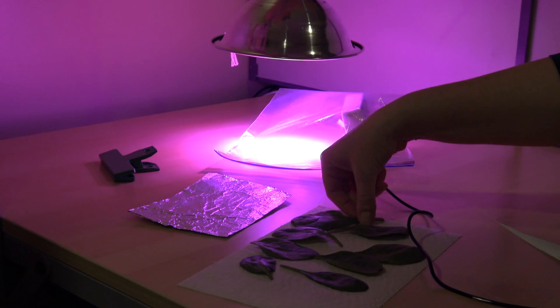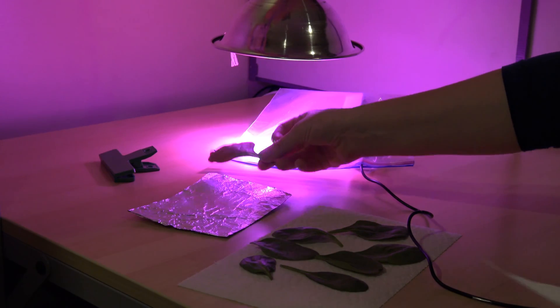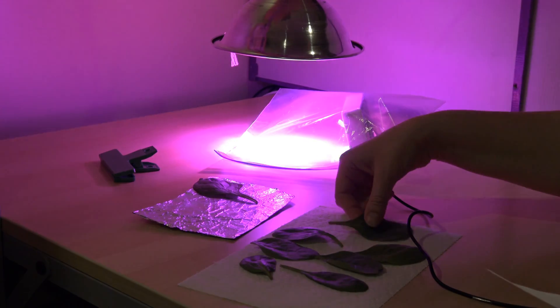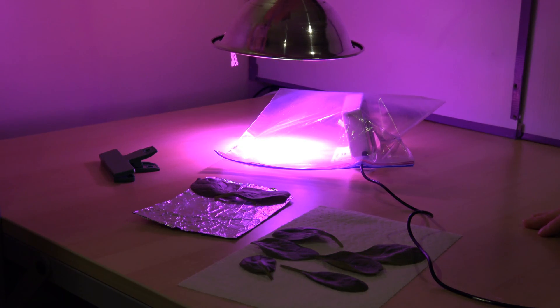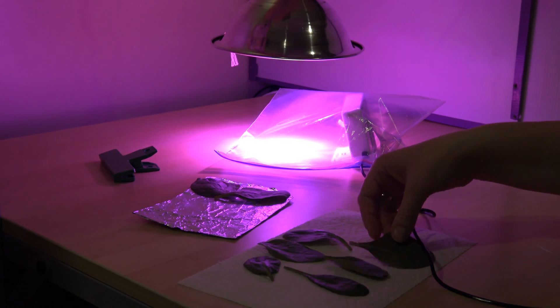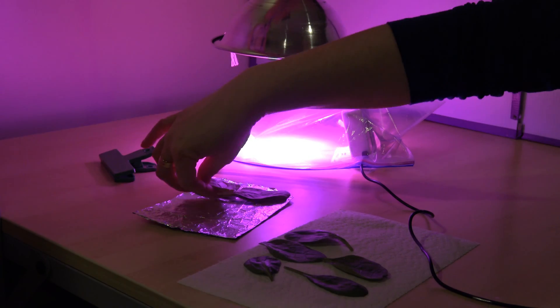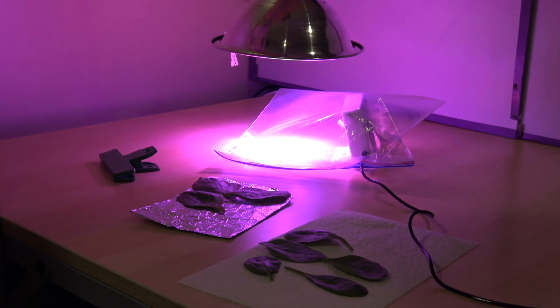We're going to place our leaves on this tray and we want to arrange them so that they're not overlapping too much so we can maximize the area that will be irradiated by our hydroponic grow light.